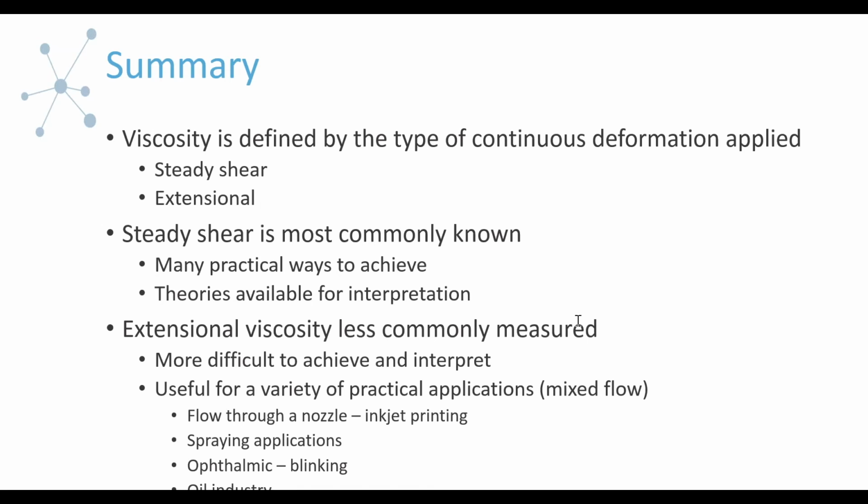We do have temperature control on the instrumentation, and we do have a high temperature system that goes over 100 C, but 280 C is a bit too high. At the moment, 280 C would be too high for this type of testing. We can only go to maybe 110 C at this time. So your particular melt I don't think would work because we can't get to that temperature, but certain ones would if they have lower transition temperatures and you could actually load them.